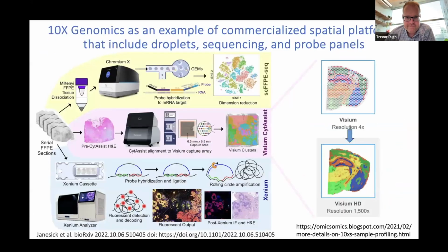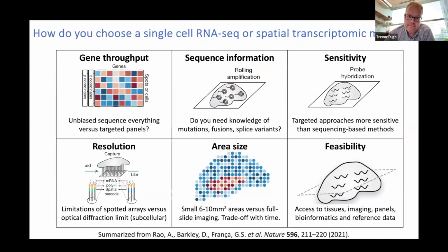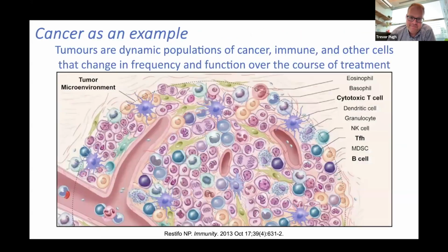Practically, though, we would see that just if it's pre or post lysing, right? Whether we're labeling with an antibody before lysing cells versus after? Or is that too simplistic, maybe? I don't know. I mean, the antibodies will stick with proteins even in a lysate. All right. I don't know if you could paste that. Thank you for your thoughts on that.